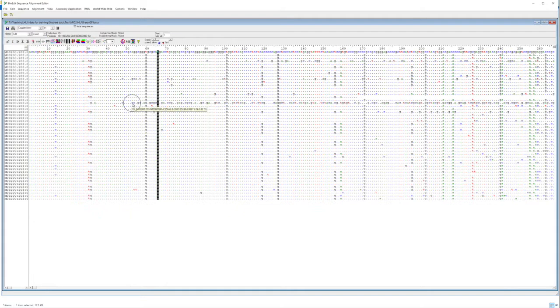And then if something had been deleted from this read with respect to the others, I can just replace that by putting a dash in here to show that something had been deleted. But as I put some dashes in, I notice that it still does not line up very well. So I'll just remove those dashes. So if something had been inserted into the sequence with respect to the other sequences, this C perhaps might be an insertion.